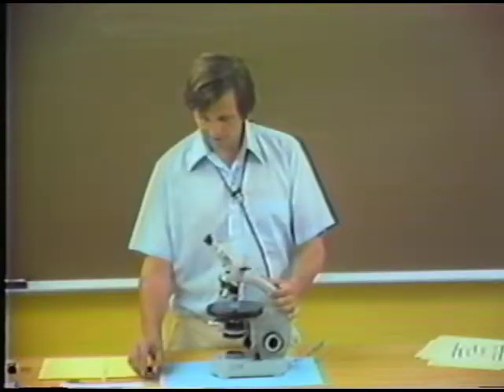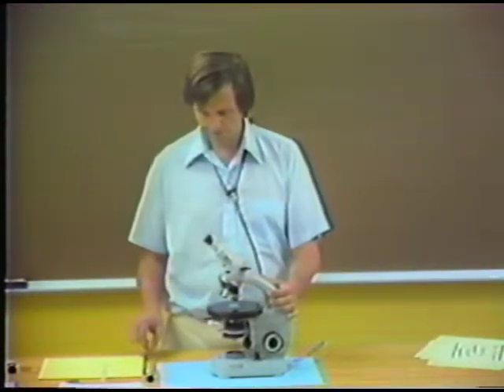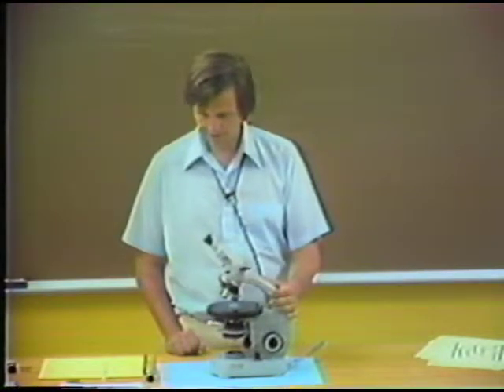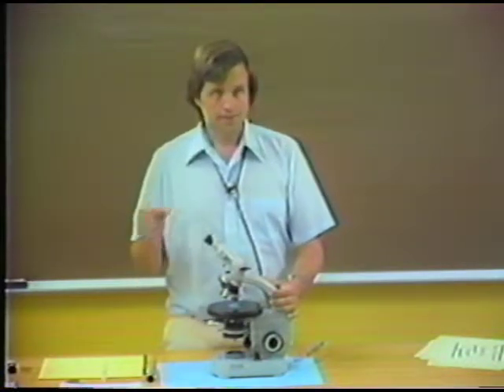Since the mounting medium has a refractive index of 1.576, then I now know that the refractive index of this mineral is less than 1.576. So this is how I tell the difference between positive and negative relief. And this particular mineral in this mount shows negative relief.